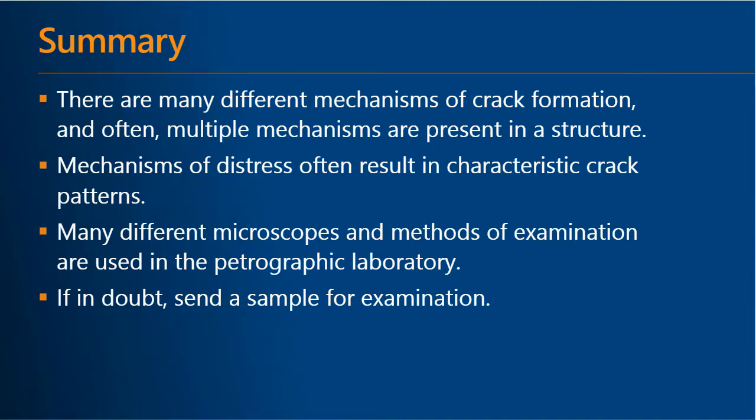But luckily, a lot of these cracks have a fingerprint that we can use to differentiate them from one another in the laboratory. So we look for this specific crack pattern under the microscope and using all of these different techniques to differentiate these mechanisms from one another.